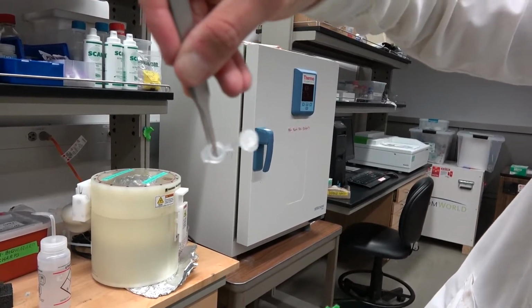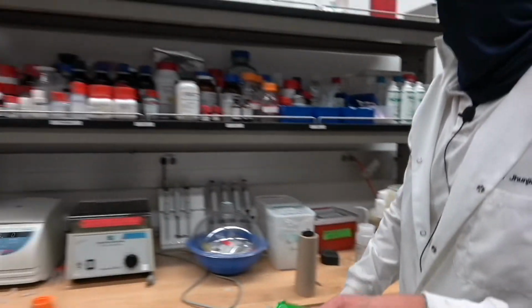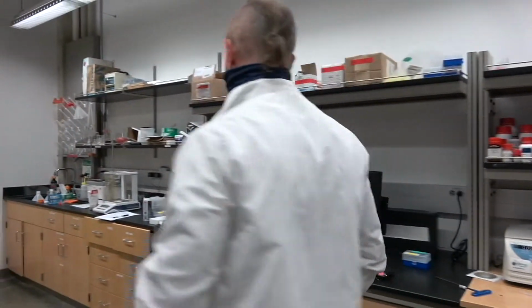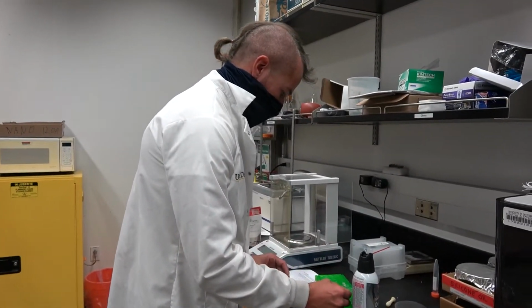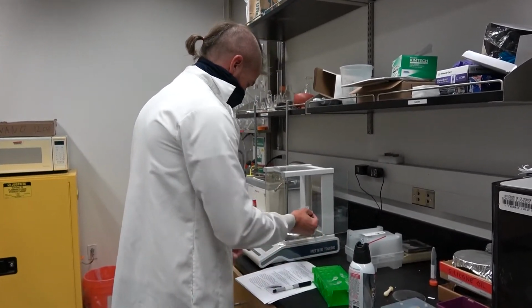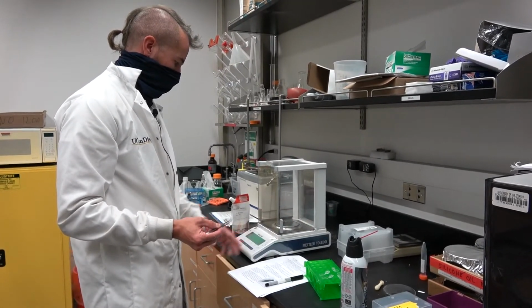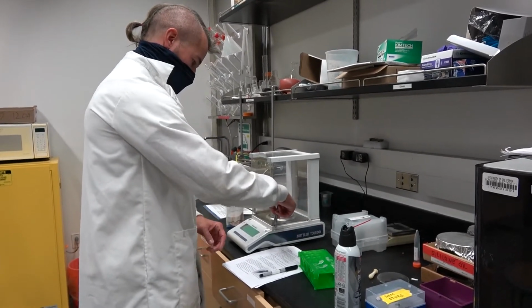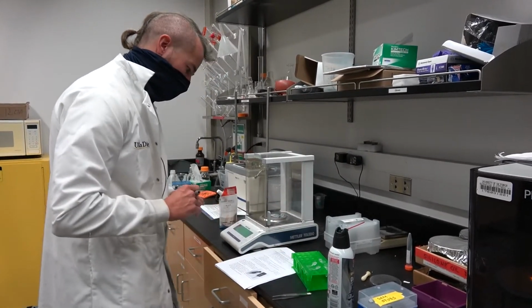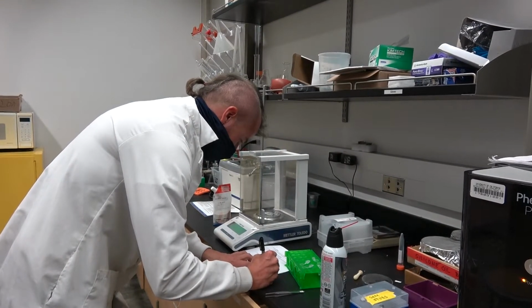And I want to try to be a little careful that I don't touch these just because the oils on my hands can change the weight. So if we walk over to the balance, we can obviously start recording these final values.